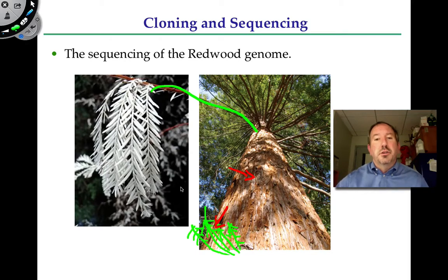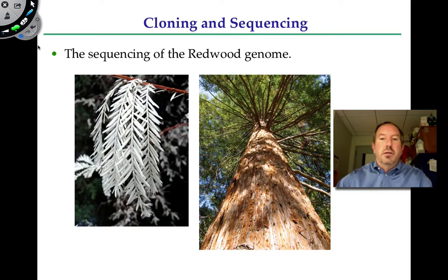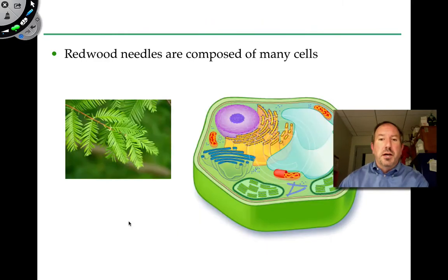So here's our question. If this is part of the original tree, then how come the albino is white in the first place? Our question is, does the albino share the same DNA as the parent tree? How are we going to do that? How are we going to compare DNA in trees, this tree and the burl and the albino and other trees? How's all that going to work? That's what this slideshow is really all about.